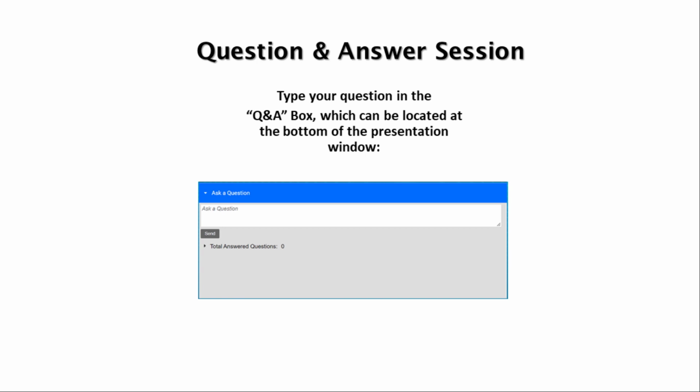I have methods with 2.6 micron and 1.7 micron particle sizes. So can I move these methods to 2.7 micron and 2 micron particle sizes without revalidation? Yes, as long as your system suitability is met and verification of the method has been done. So that would be really easy to do, just to move those over to Halo particle column sizes.